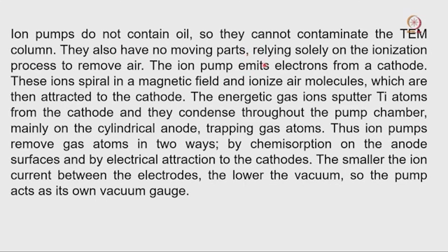They rely solely on the ionization process to remove the air. So, those are the two good things: we do not have to use oil that could contaminate the column, and it is a very silent pump, with no moving object, depending only on the ionization of the gas molecules. The ion pump emits electrons from a cathode.